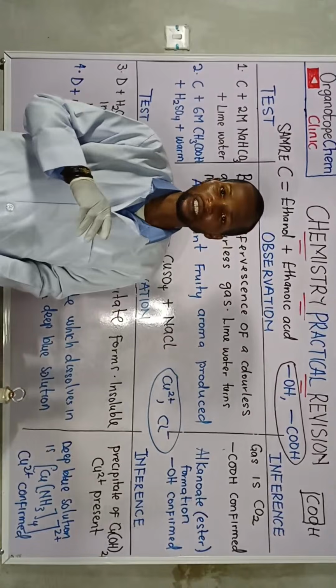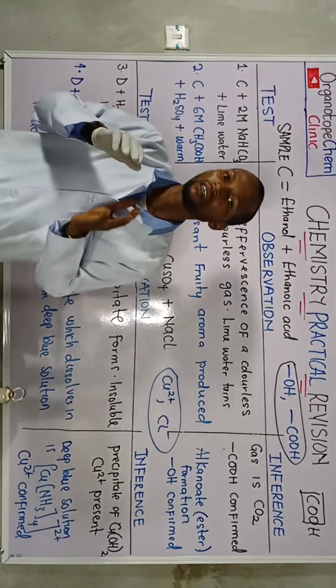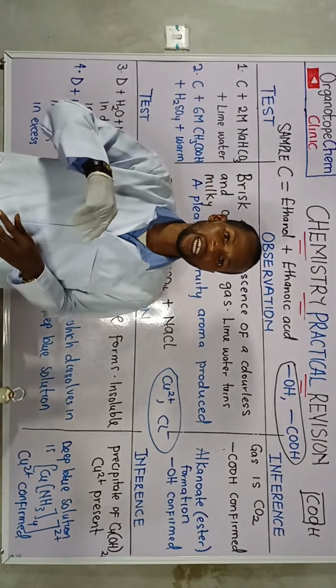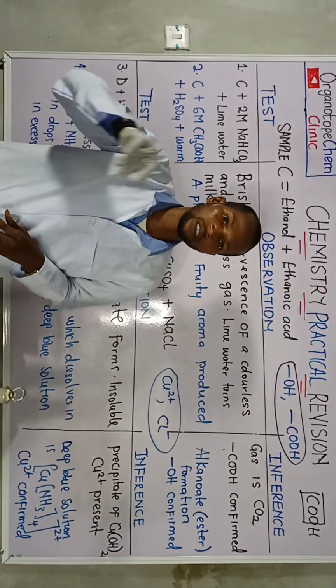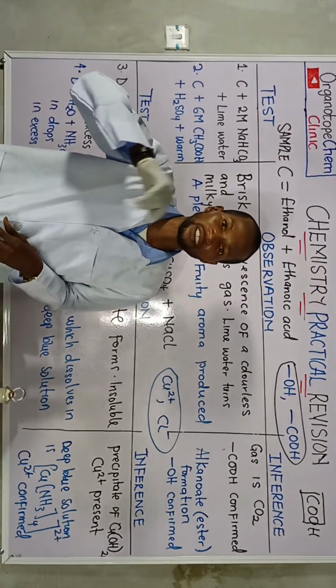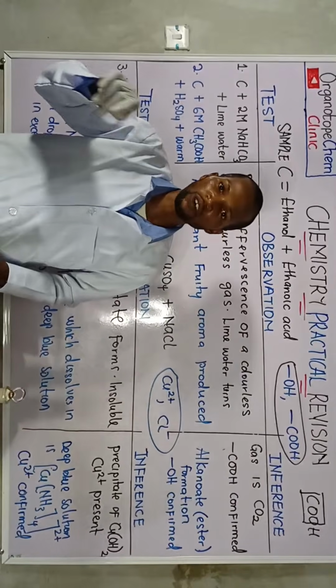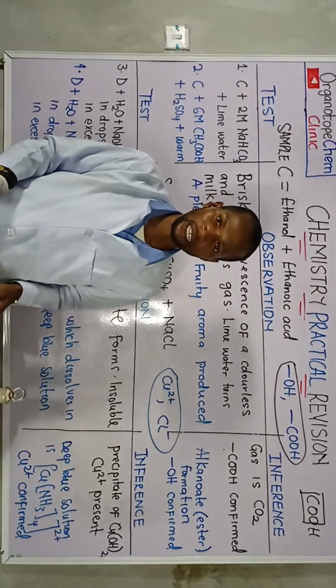Note this in your exam, they may write the compound in words, okay? But when you are writing the test, you are not expected to write in words, you are expected to write the chemical formula. So potassium hexacyanoferrate 2. Is that taken?